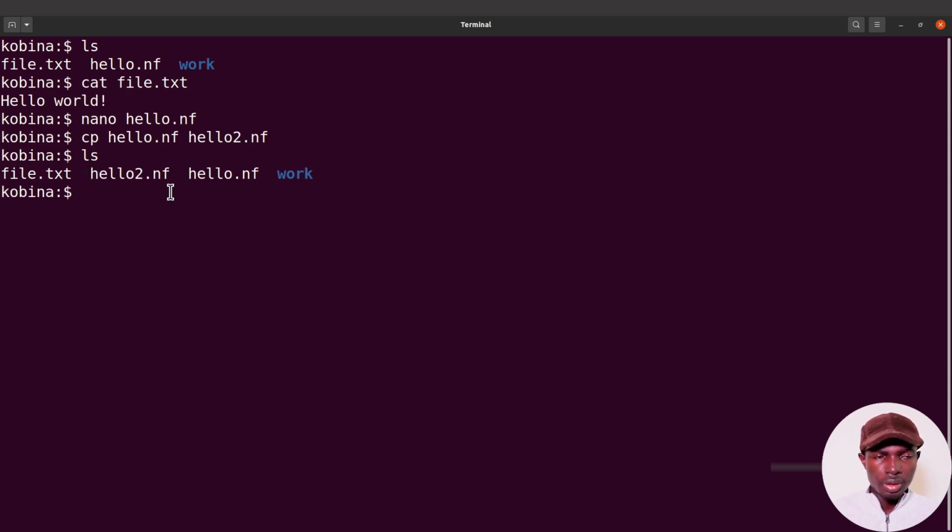Now I even forgot that with Nextflow, you can also give comments. I forgot to talk about that. And so maybe in another tutorial, I'll let you know how comments are also written. Or you can also check the Nextflow tutorial page. You'll find the information there.